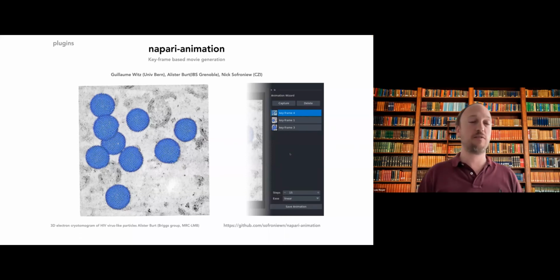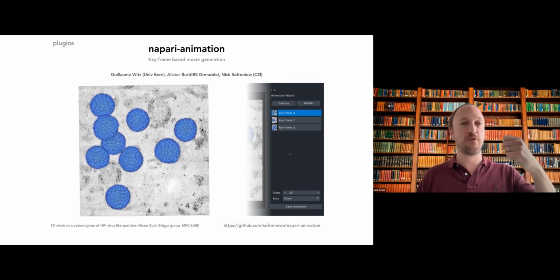So easily that biologists in the team that are not programmers by training are able to do these things by themselves. And that's the place where I get really, really happy, is when non-experts start to use Napari effectively. And of course, they need a little bit of training. They need to be exposed to, it's still Python-based. There's still a few things that are still a little bit hard for non-experts.